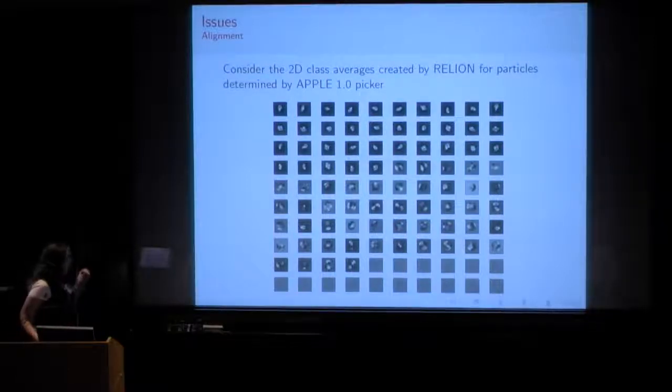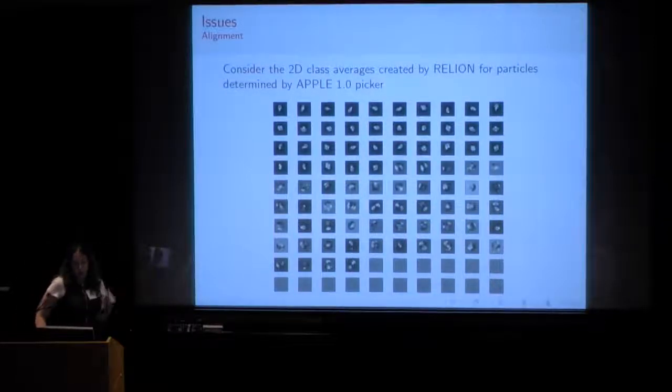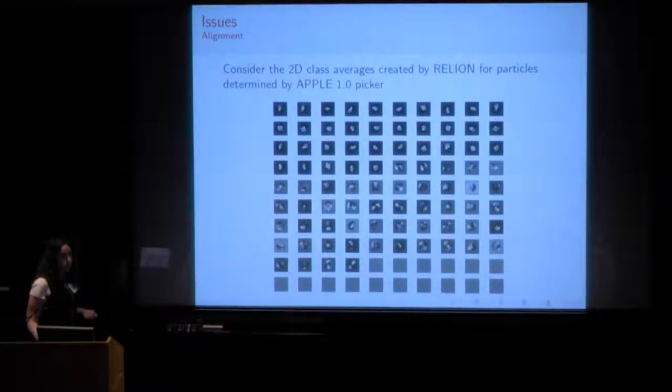So we tried doing this, and we were able to get the class average done in 70% of the time, and still our reconstruction was the exact same resolution, 4.1 angstrom, because we did in fact throw out all the particles that we would have thrown out in the class averaging from Relion.